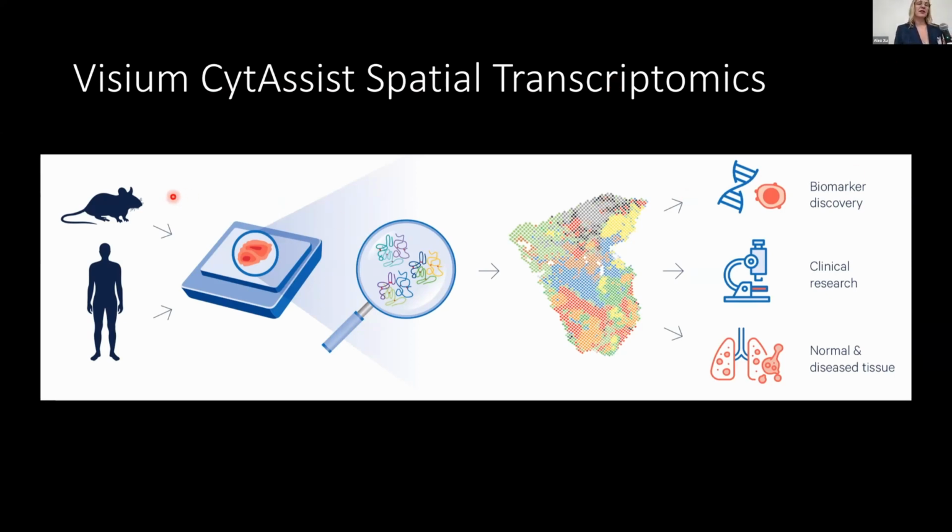So Visium, of course, this technology uses mouse and human. We don't have human, we have non-human primate. And so this is one of the caveats of the technology, I believe, so far, is that there's only 2 species. But biomedical research involves more than 2 species. And I think that there would be a benefit for these companies to start thinking about, rather than us building custom everything, actually building platforms that more scientists can use.